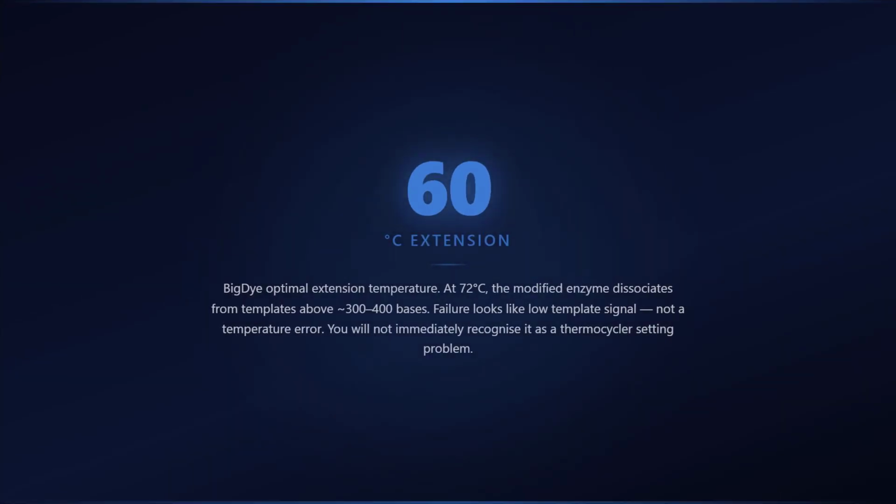The mechanism is the enzyme's thermal stability profile. The modified polymerase in BigDye achieves its optimal processivity and accurate ddNTP terminator incorporation ratio at 60 degrees. At 72 degrees C, the enzyme remains active but begins to dissociate from longer templates before completing extension. Fragments above approximately 300 to 400 bases are systematically underrepresented.